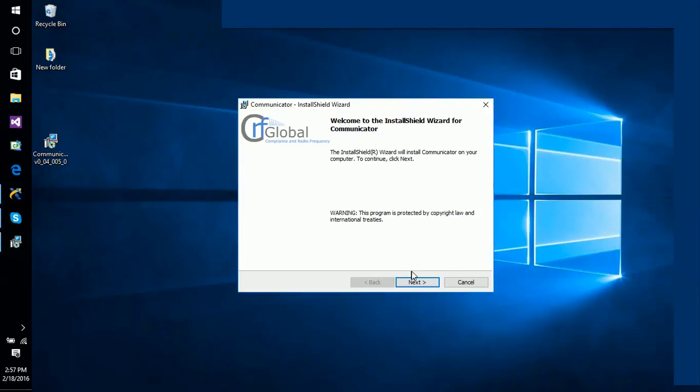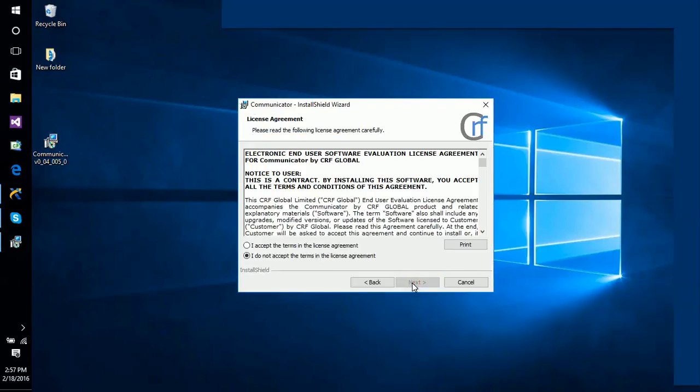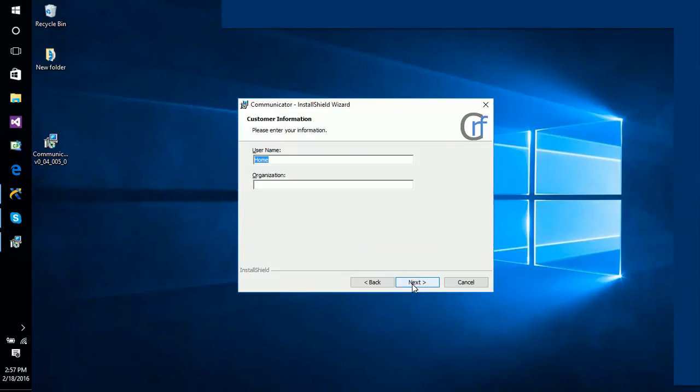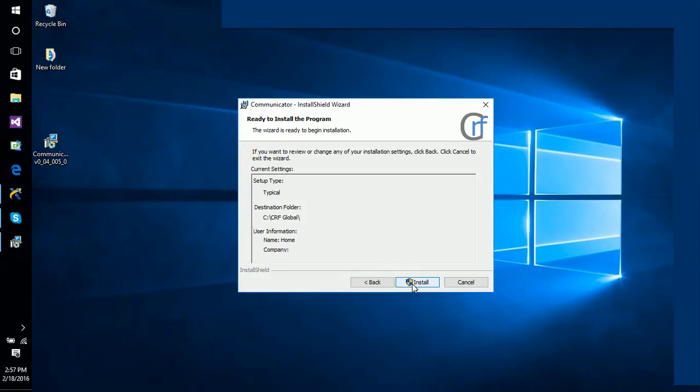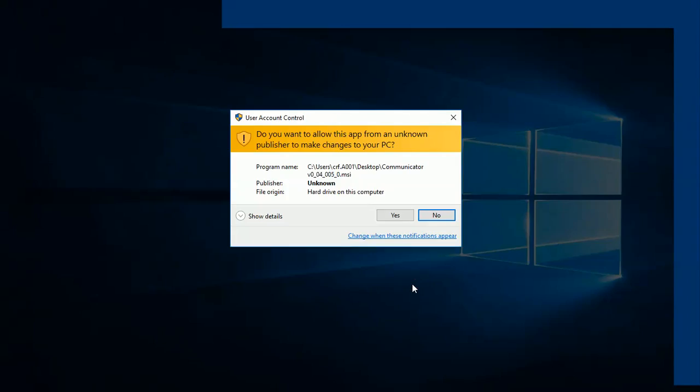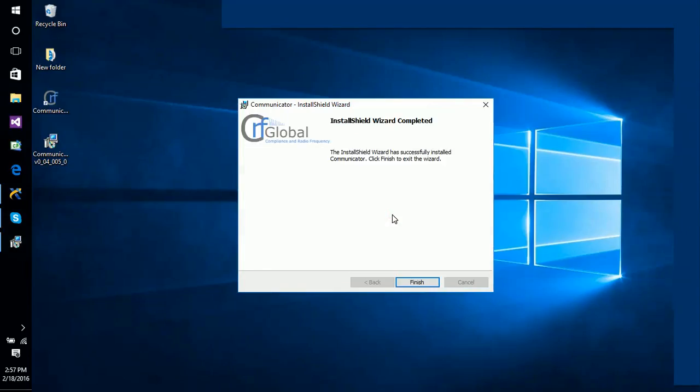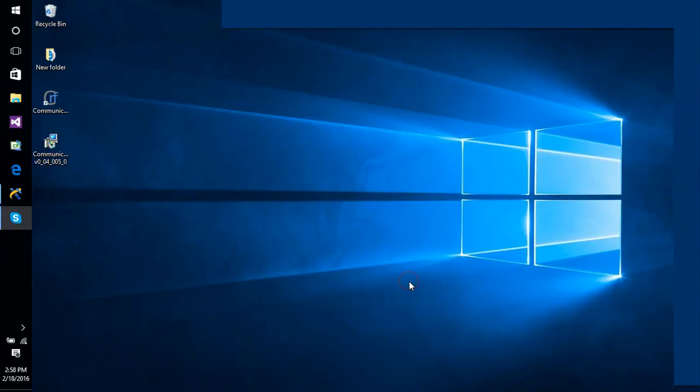The Communicator application is an application that allows you to communicate with your instruments. It's quite simple. It works with serial devices, GPIB devices and LAN setups. Predominantly we have two modes of operation. We have a Visa mode, which sits on top of the Visa application and then it will work with Agilent, Prologix and National Instruments. Then we have a non-Visa mode, which will only support ASRL, LAN and Prologix devices.